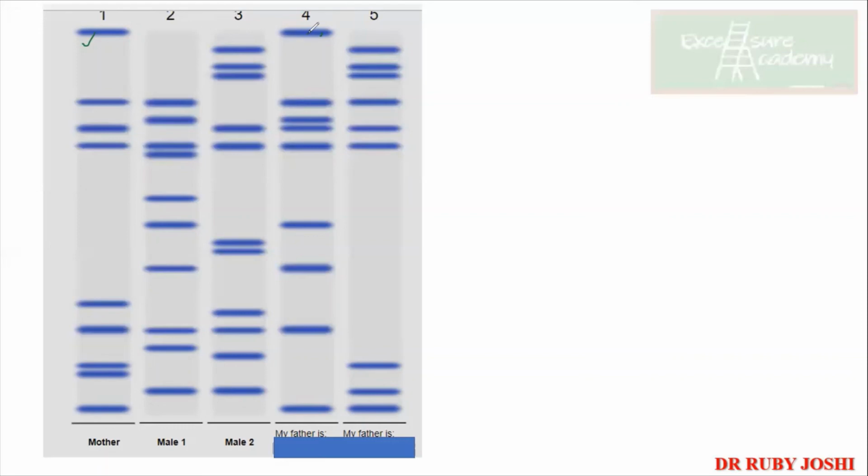So what do we see? ये वाला band present है? नहीं. ये वाला band present है? Yes. Okay. Now what about this band? This band is present here also, here also. This band present here also, here also, here also. तो इसका क्या मतलब हुआ?